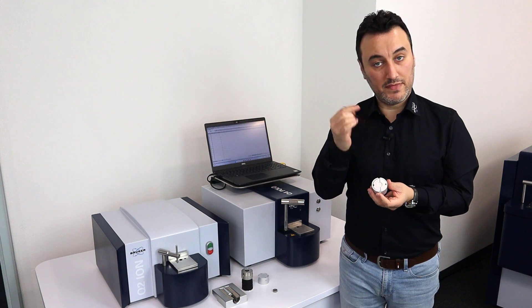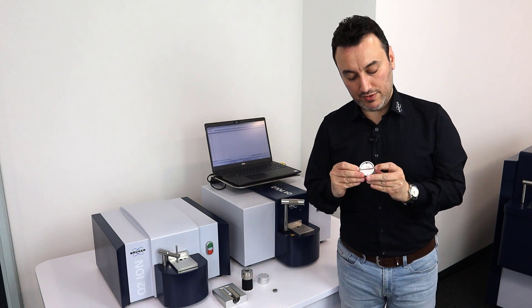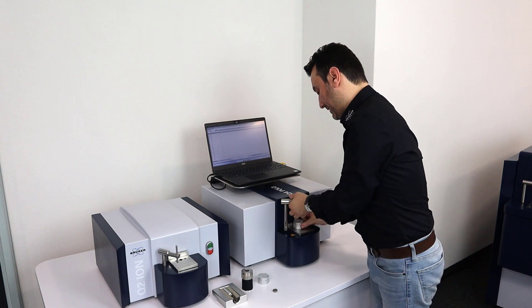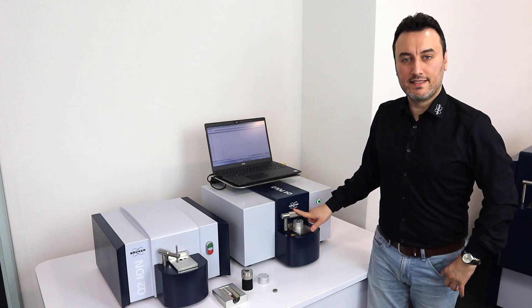The groove is for the wire. I place my wire in the groove, press it, flip it over, put it on the spark stand plate, and then place the clamp on the sample adapter. As easy as that.